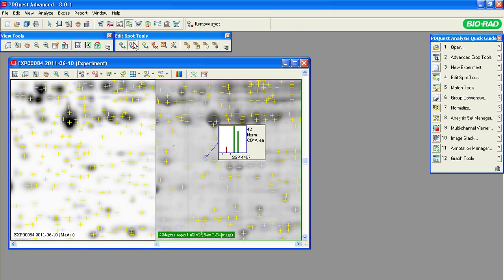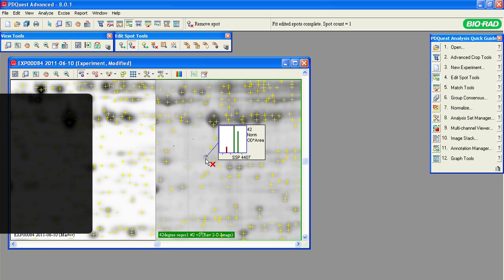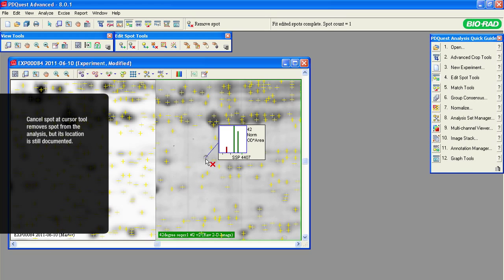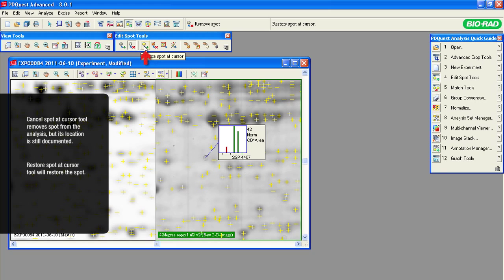Click the Remove Spot at cursor button and point to the bubble spot on the gel. This will remove the spot entirely. Alternatively, you can cancel the spot. Canceling the spot will remove it from the analysis, but PDQuest software will still remember its location. The spot can be restored by clicking on the Restore Spot icon and pointing to the canceled spot.